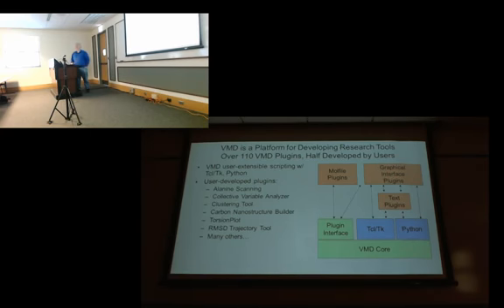And in fact, if you look at the source code of VMD as it is distributed today, there is roughly twice as much code in the form of scripts now than there is in the form of C++ or CUDA or the other more expert-oriented languages. And so this allows VMD to be extended by anybody, and you can even take the VMD that's running on your laptop and add new things to it right now without having to compile anything.